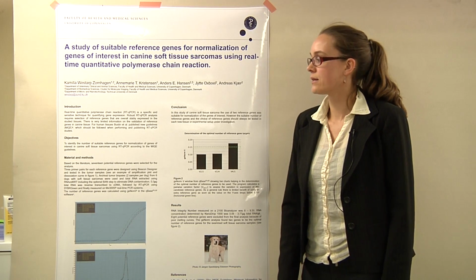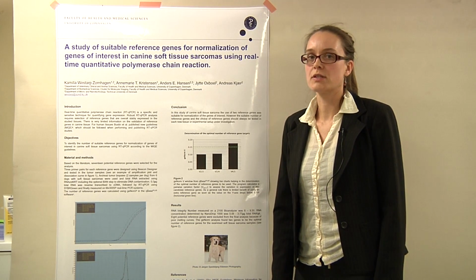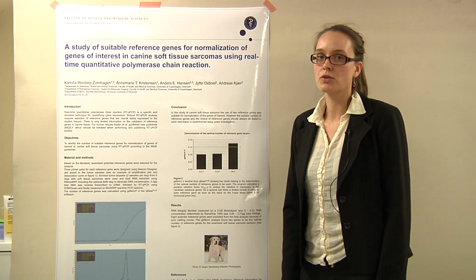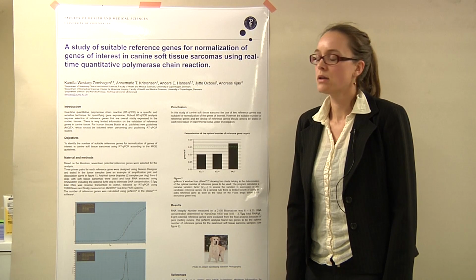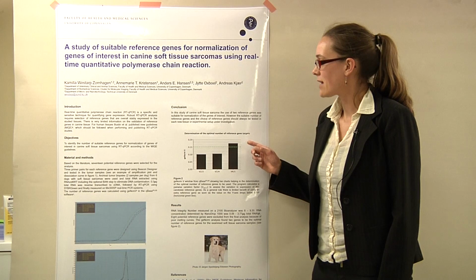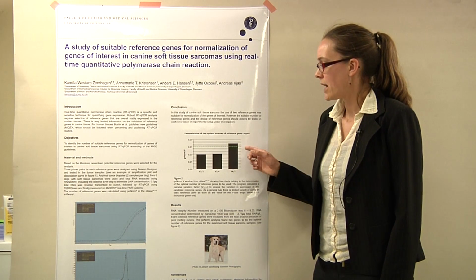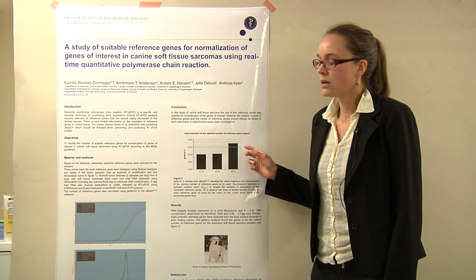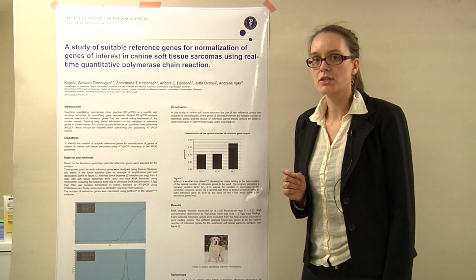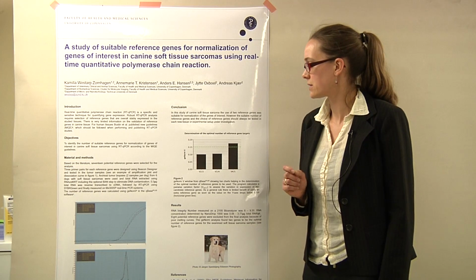To calculate the suitable number of reference genes, we used the geNorm algorithm in the qbase Plus software. This software, designed by Hellemans et al., calculates a pairwise variation factor to assess the variation in expression of 2 candidate reference genes.